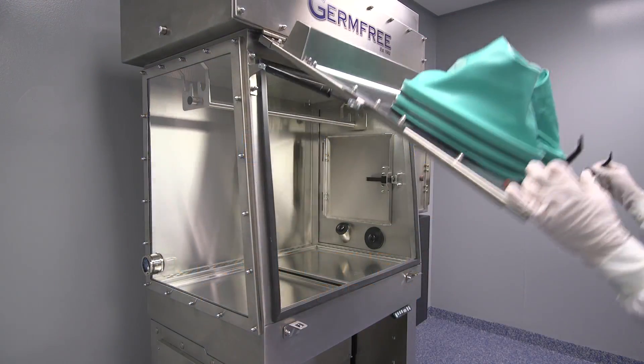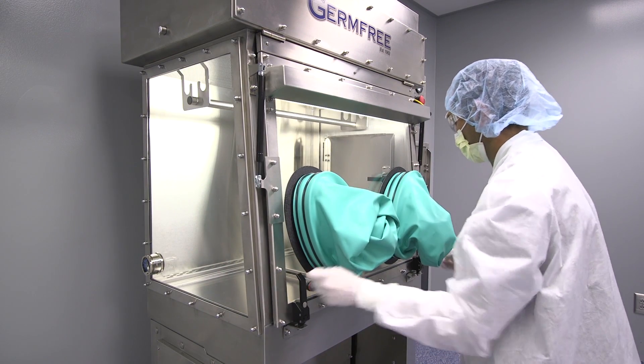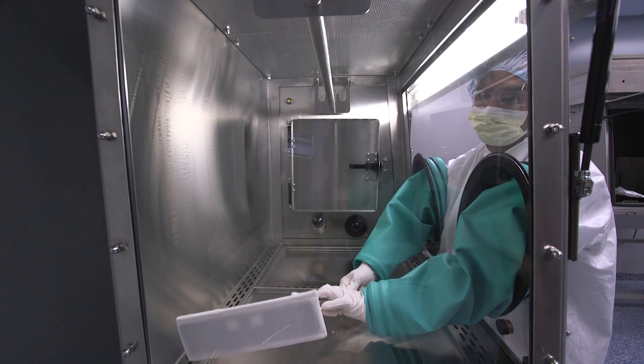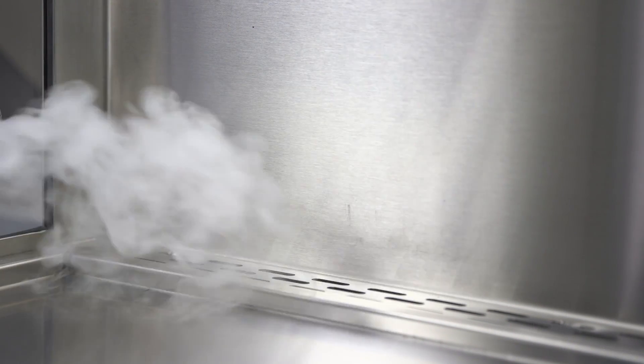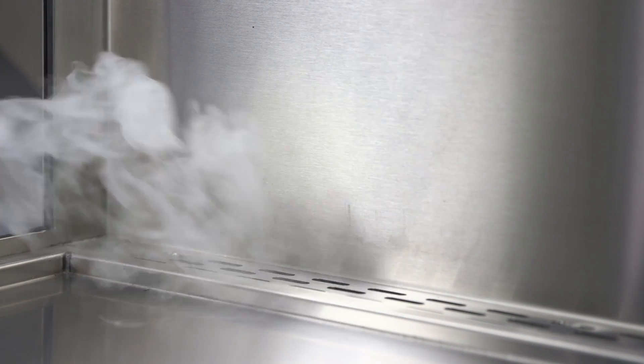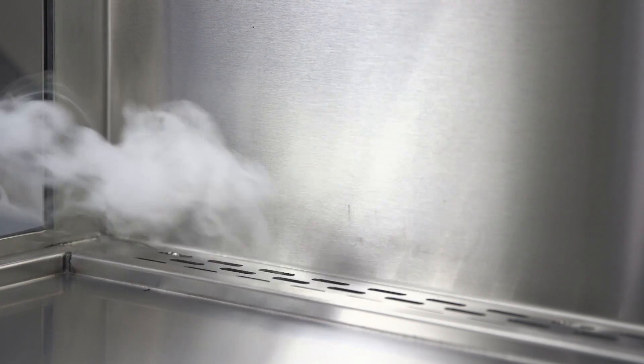This video covers how to clean a positive pressure germ-free LFGI. This unit maintains positive pressure within the work area in order to keep environmental contamination away from the products being produced inside the LFGI.